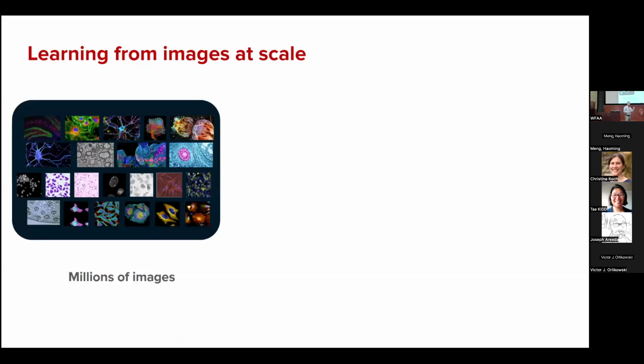First of all, we are going to collect a bunch of diverse images that have been reported in the literature already, and they are deposited in repositories where people share the results of their biological experiments. There are many of those, and we started collecting images from those repositories.